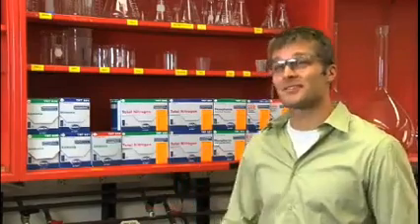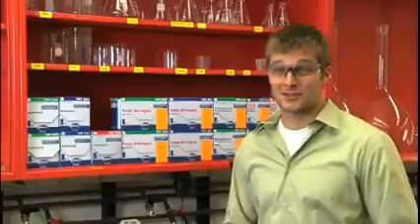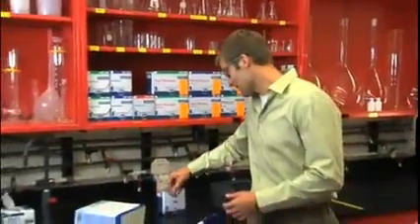Plus, the smaller environmentally friendly packaging takes up less space in your lab. Let's take a closer look at the vial.